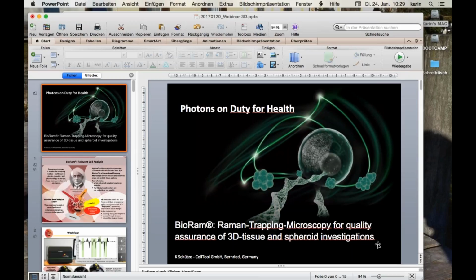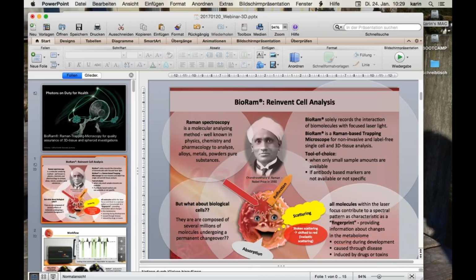My name is Karin Schütze, and I would like to introduce to you shortly, for those who have not been there for the first time, why do we use the Raman analysis? It is because we get the information about the entire cells and not only about the surfaces.